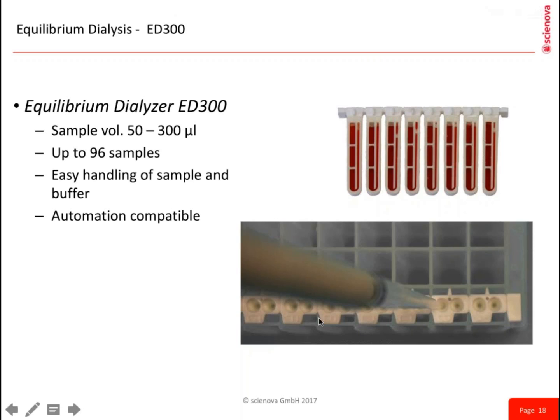As you can see here, there are two openings in this dialyzer, and the first one is for loading and removing the sample in the inside of the dialyzer, and the right one is for removing or loading the buffer in the outside. So there's a little channel in the dialyzer which you can use for the buffer.